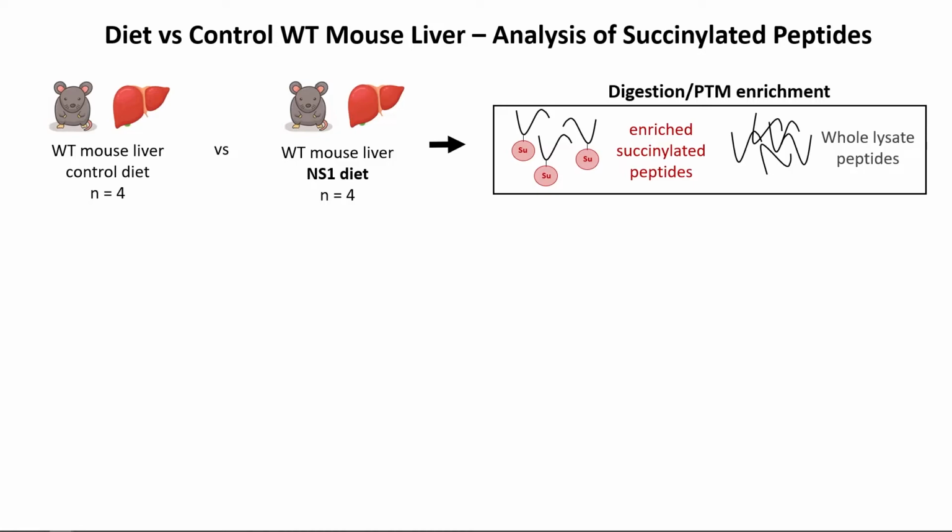And so, we have a collaborator in Pittsburgh, close by, right? A couple of hours. And they have some kind of diet. It's just a nutritional supplement, something you would eat anyway. And when you give this to some wild-type mice, they are healthy, and then we enrich for succinylated peptides. What would you get? Can this diet somewhat improve health of these mice? So let's see what happens.